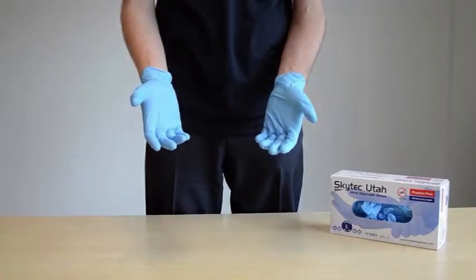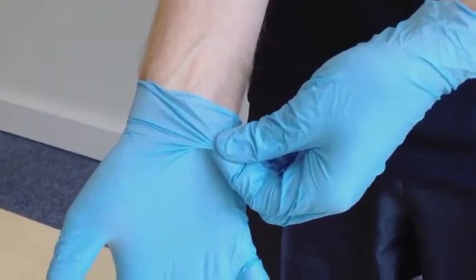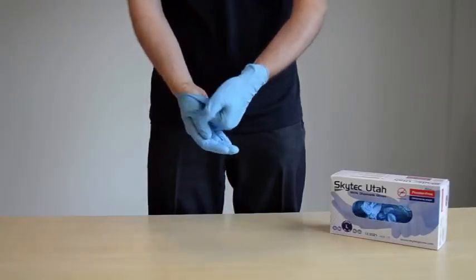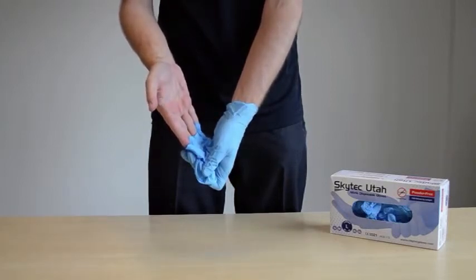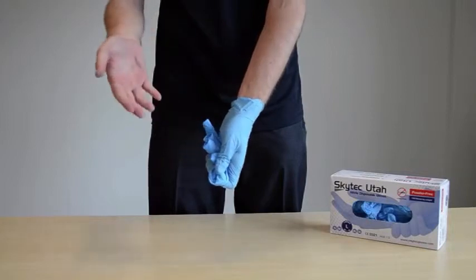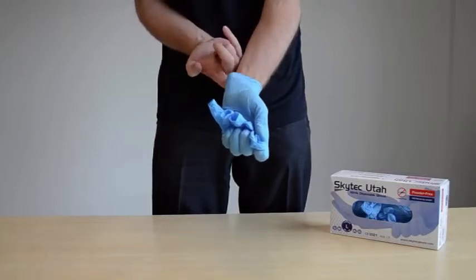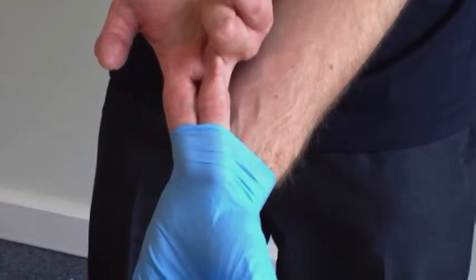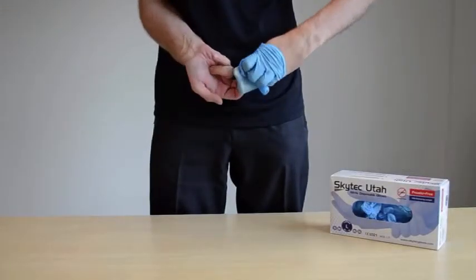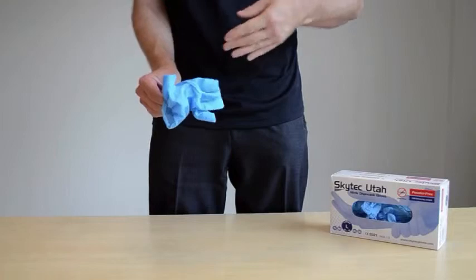When removing, first, grasp the outer edge near the wrist area. Fold it over and peel it away from the hand, turning it inside out as it goes. This will trap potential contaminants inside the used glove. Once the glove is off, hold it with the gloved hand. To remove the other glove, place the bare fingers inside the cuff without touching the glove's exterior. Now peel it off from the inside, turning it inside out as it goes and using it to envelop the other glove. Finally, discard them appropriately and never wash or reuse disposable gloves.